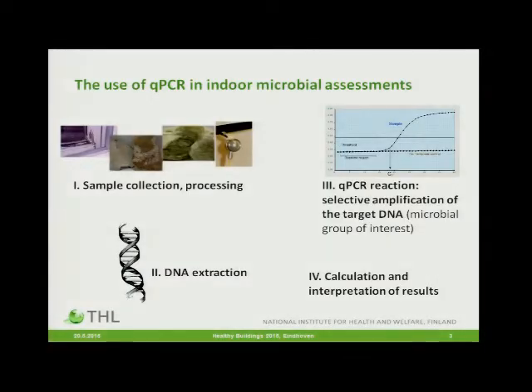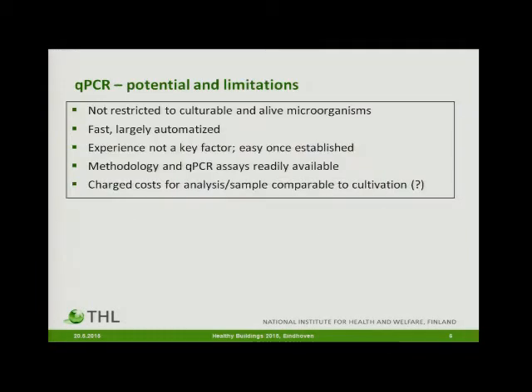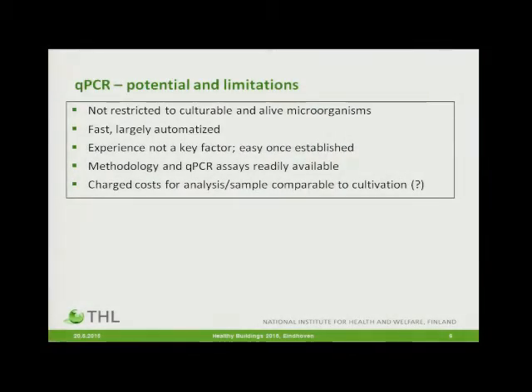What we've heard already today, you see what you're looking at, and finally you got a calculation, interpretation of results. So I've seen on a slide today, I don't remember what it was: speed. So what's the main advantage of quantitative PCR or of molecular methods in general? It's speed. It's one. I'm not sure it is the main advantage. First point, probably we could have a discussion like half a day about this, whether that's an advantage or a disadvantage.